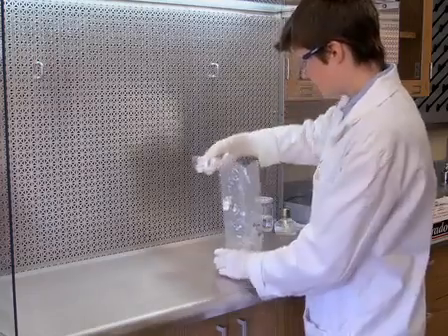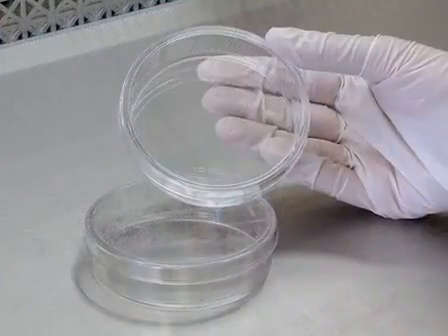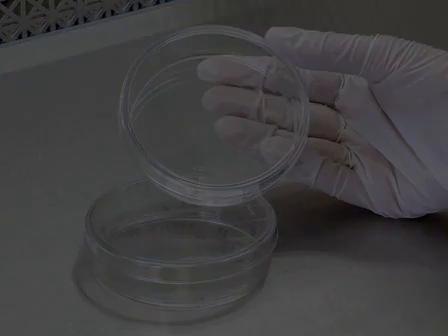For these experiments, use petri dishes that are 1 centimeter deeper than typical petri dishes to increase the headspace above the wood block in the microcosm.